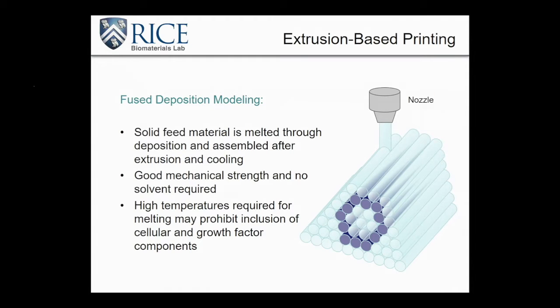However, we are going to talk about later some strategies we can use to increase the bioactivity of growth factors and drugs if we want to include them in fused deposition modeling, which is why I'm including this here, even though it's not compatible with our bioinks with live cells in almost all cases.